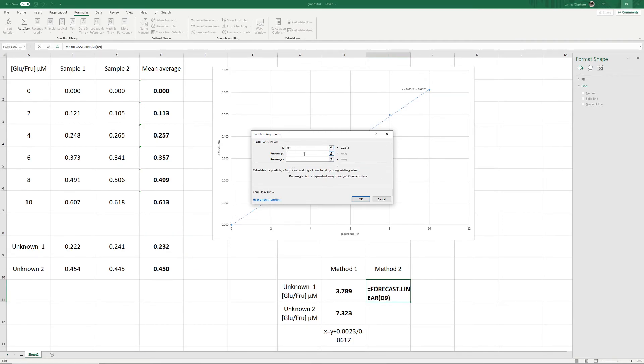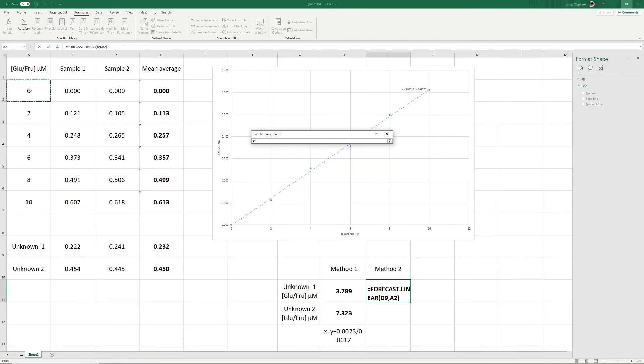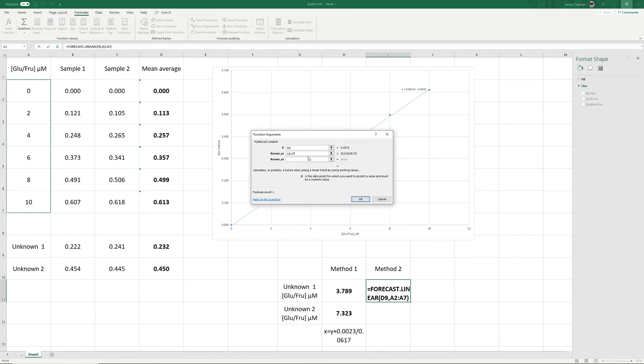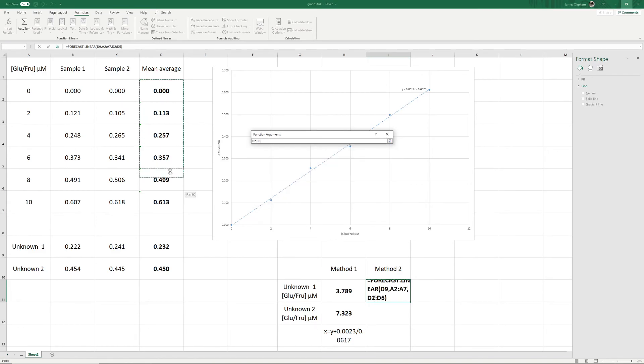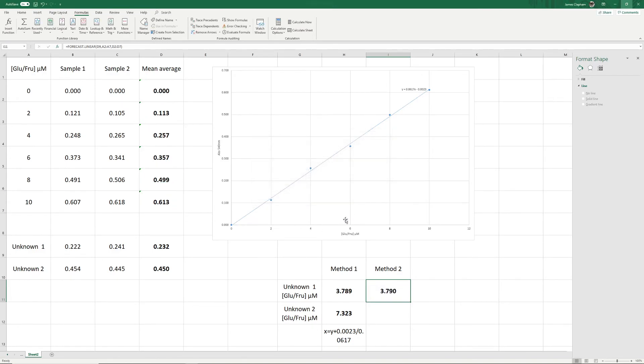We then need to put in the known Ys and X values. For this formula to work correctly, you actually need to put the Xs into the Ys and the Ys into the Xs. So our known Xs are our concentrations here, so we'll just select those. And our known Ys are the absorbances here, so we select those. Then click OK. You should end up with a very similar, almost identical value to the value you got doing it through the first method.